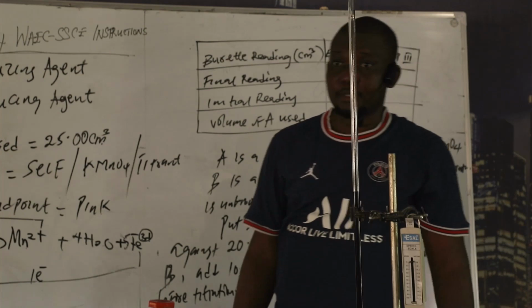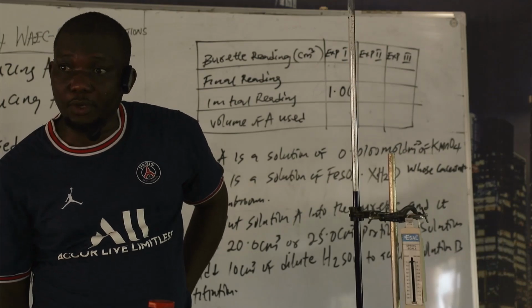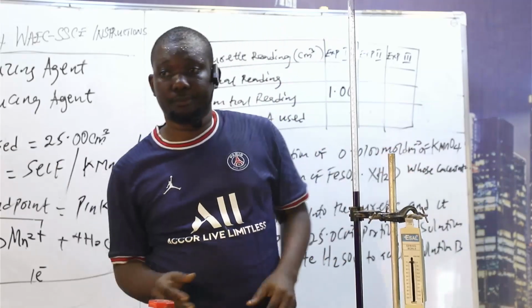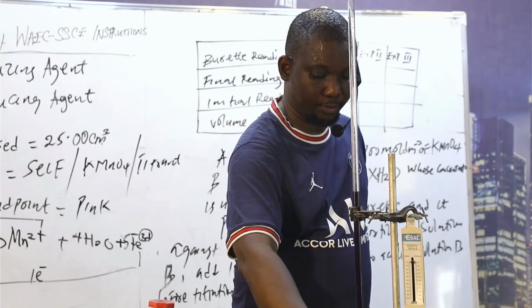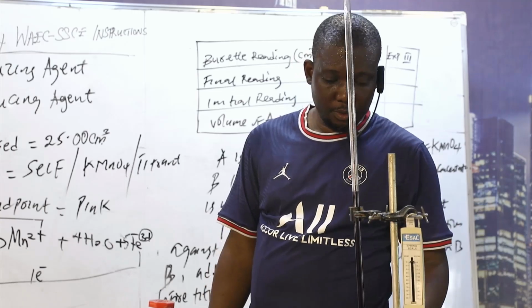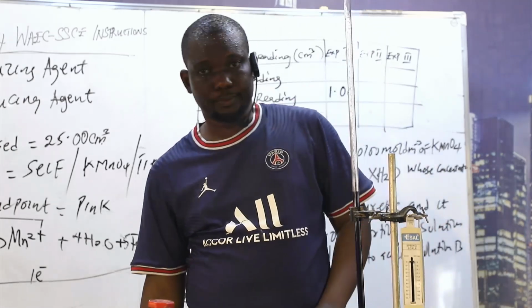If you overshoot, you have a wrong reading. It will still give you color, but the color will be overshooting. You overshoot the color. The color will be changing upon oxidation. But this is the actual color we have.